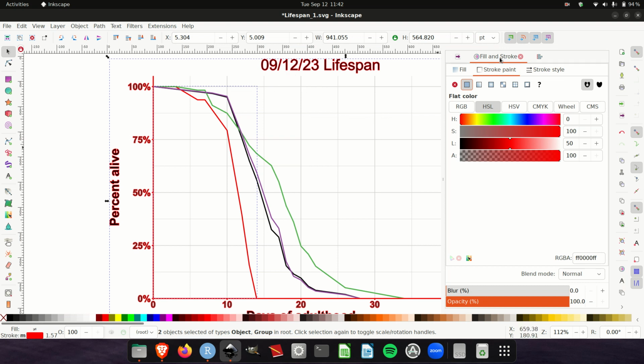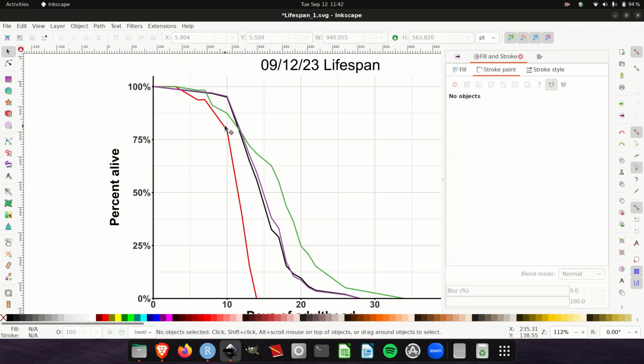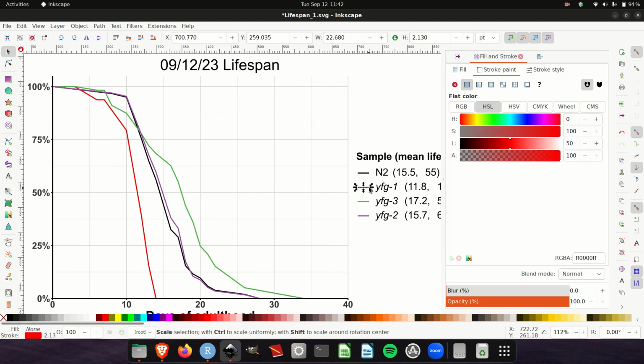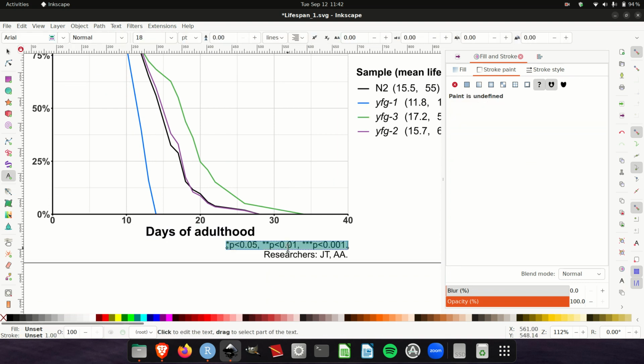Of course, it still has some grouping issues. So if we go Control-Z, I grab this and I go over here, I'm going to have to ungroup these guys. So Control-Shift-G. Now I can grab that line and that line only, and then of course change these to whatever I want. I can edit any text in here.